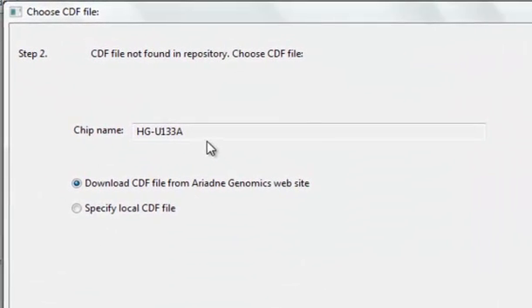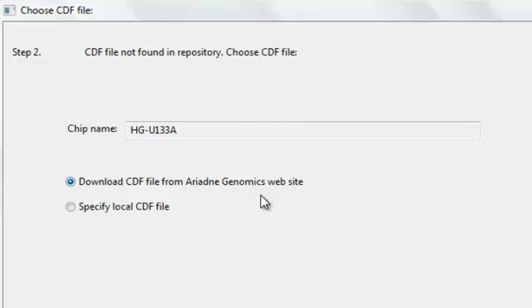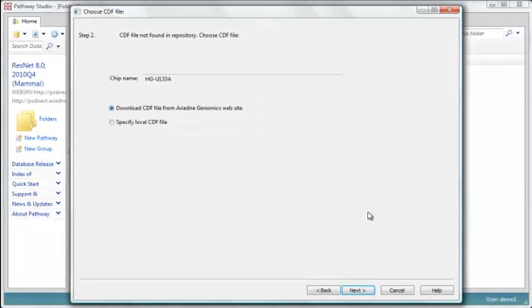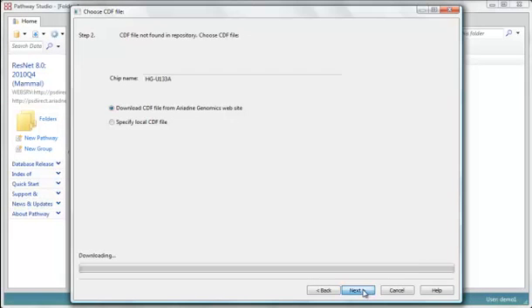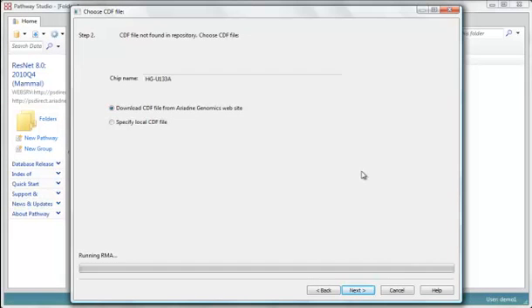So in this case, the CDF file, which is used to interpret this chip, was not loaded on this computer. So it will have to be downloaded from the Ariadne's website. That's a one-time thing, so if you ever do HGU-133A chips again, that won't be necessary. The CDF files can take quite a bit of time if you need a lot of them, so it only brings the ones you need.